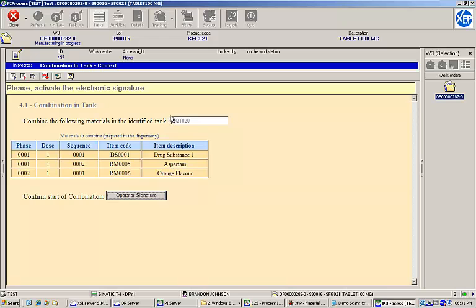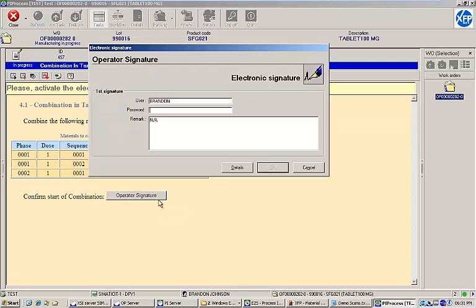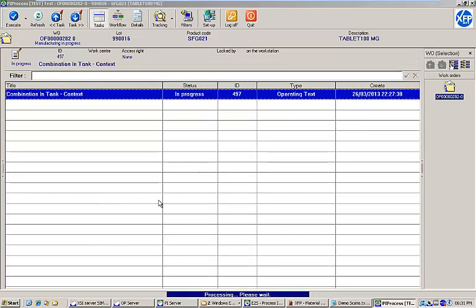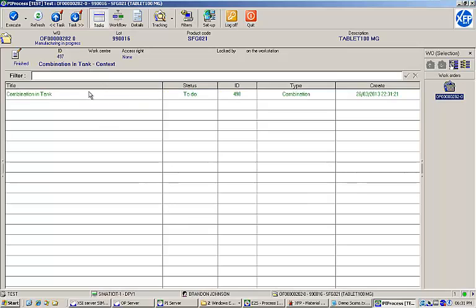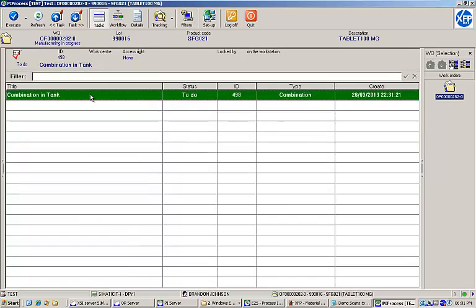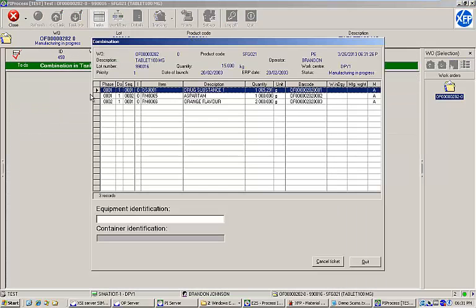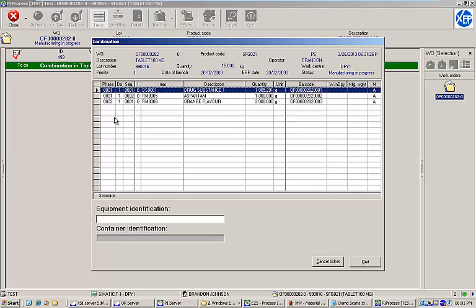Once I sign, the task will open another standard module. The combination screen displays my work order details at the top and shows all the materials that I weighed earlier in the process. At the bottom of the screen, I'm prompted to identify the piece of equipment that I want to combine the materials in, and then scan the weighing label of each material to confirm combination.